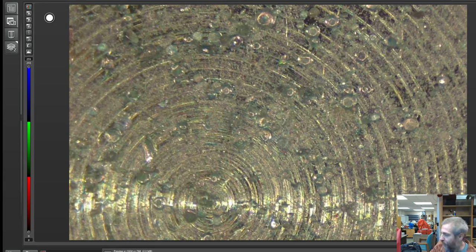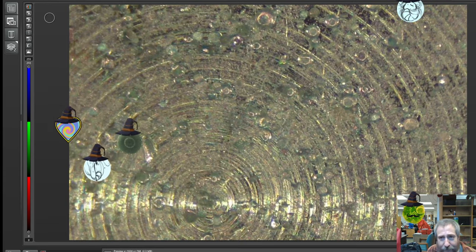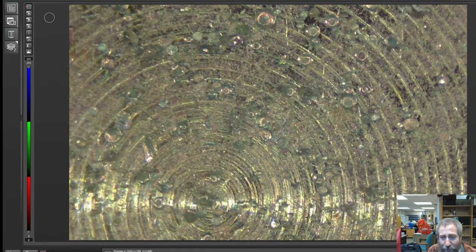And I was gonna write something out, but it's challenging to actually write something for a lot of reasons. One, it's pretty easy to break diatoms when you're trying to pick them up. And two, we don't actually have a pig eyelash, which is what we should be using, right? Thank you for giving Headshot Specialist a shout out, Pacific.